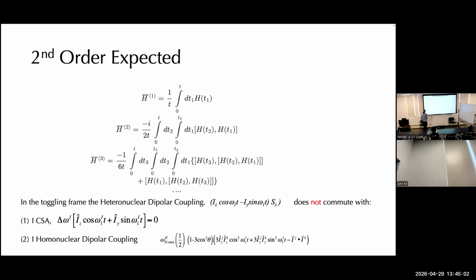And there's another term, which is the CSA and the isotropic shift. So the isotropic shift, we could have just said, well, just be on resonance, want it to go away. But the CSA, there's no magic to make it go away. It is there, delta is big, and it has a Z and a Y component. So we have a big mess on the proton channel. We have 3 terms, and all 3 of them have complexity in the toggling frame.